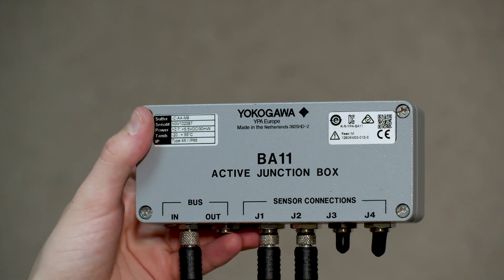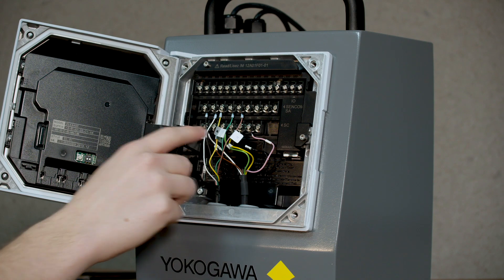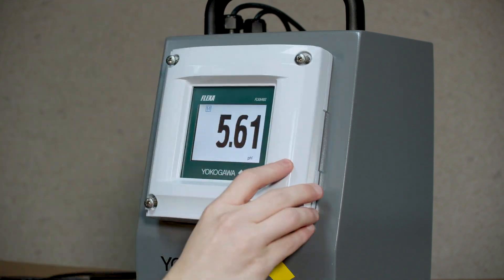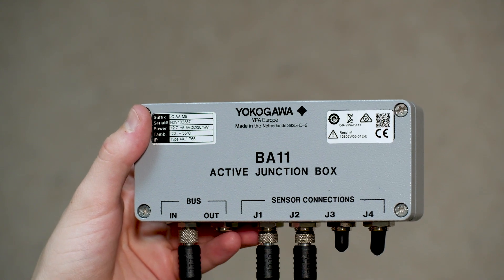First off, as you can see here, we have the bus in and this is going to be wired into the top module right here, as well as having J1 and J2 sensors connected, with J1 being sensor 1 and J2 being sensor 2.